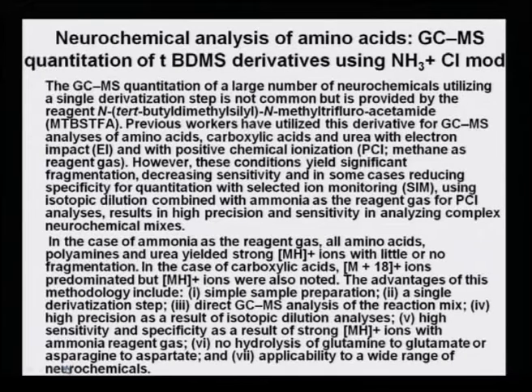And fourthly, it has very high precision as a result of isotopic dilution analysis. And fifthly, it has high sensitivity and specificity as a result of the strong MH ions with ammonia reagent gas. So, one sees that there is no hydrolysis of glutamine to glutamate or asparagine to aspartate, and it is applicable to a wide range of neurochemicals.